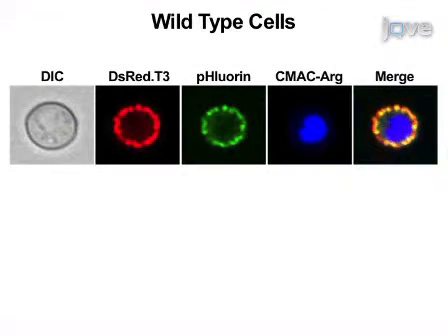Typical results obtained using MT-Rosella expressed in wild-type cells and using confocal laser scanning microscopy are shown here. Under non-starved conditions with ethanol as a carbon source, wild-type cells exhibit a typical cellular distribution of mitochondria at the periphery of the yeast cells that show both red and green fluorescence. Red and green fluorescence emission is not detected in the vacuole.